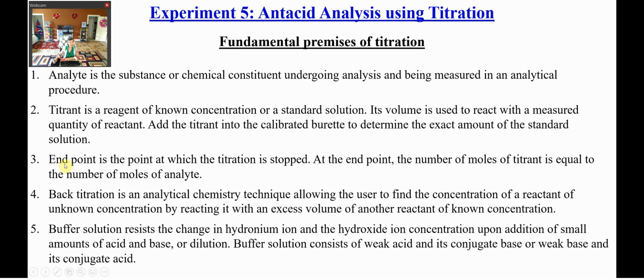Number 3, the endpoint. The endpoint is the point at which you are going to stop the titration. Be careful, this endpoint and your equivalence point are slightly different from each other. At the endpoint, theoretically, the number of moles of titrant is equal to the number of moles of your unknown sample, the analyte. Number 4, the back titration.